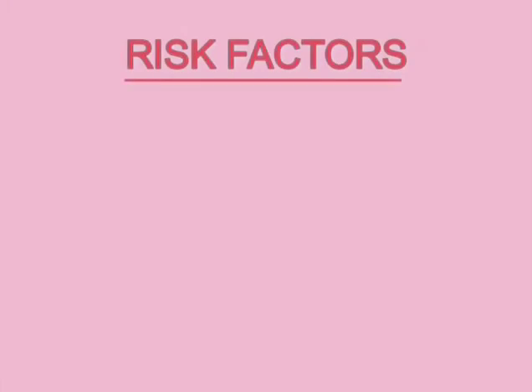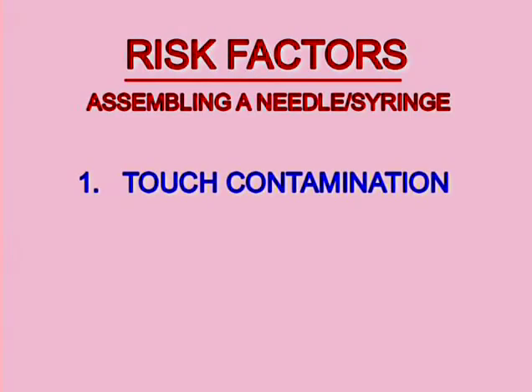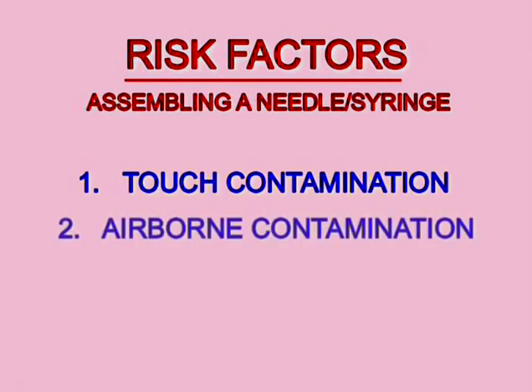The risk factors when assembling a needle and syringe are: 1. Touch contamination of the exposed hub and needle, and 2. Airborne contamination due to disruption of first air to critical sites or pathways.